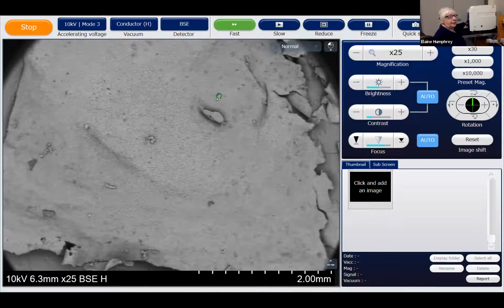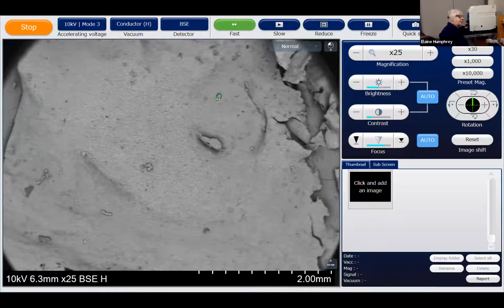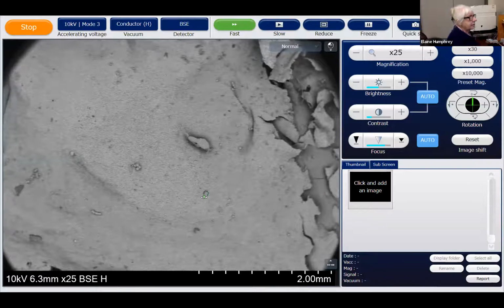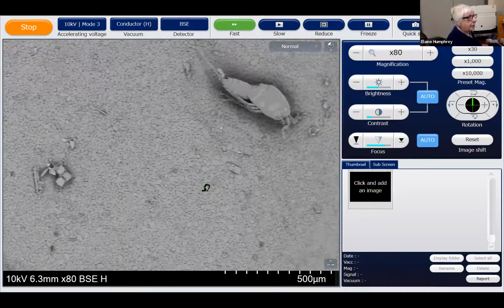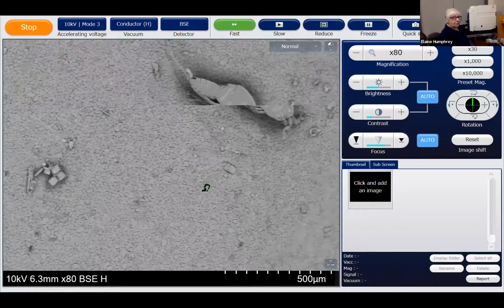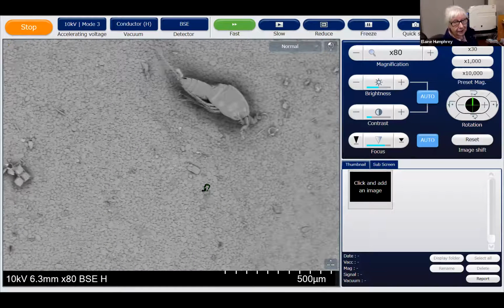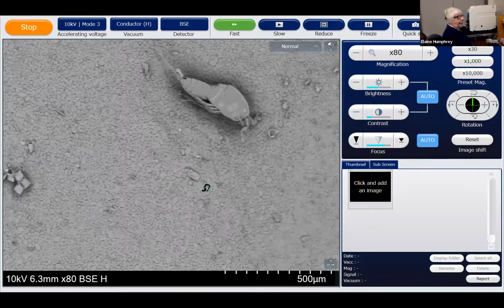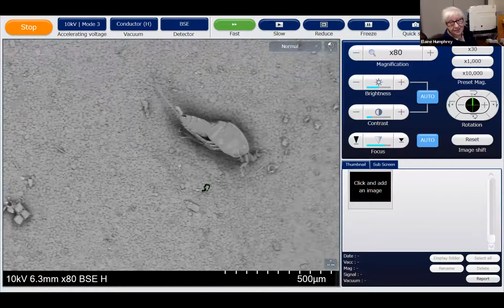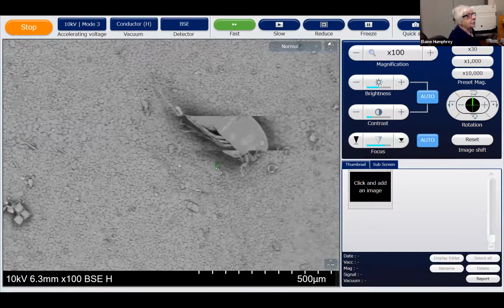This microscope is controlled by two knobs on the front, the stage, whereas everything else is controlled by a mouse. Now, most of the kids know how to use a computer mouse, but the young ones don't. The 6-year-olds don't know how to use a mouse. They are touch screen people. But they learn very fast that when you've got a mouse and you use the wheel, you can zoom in.